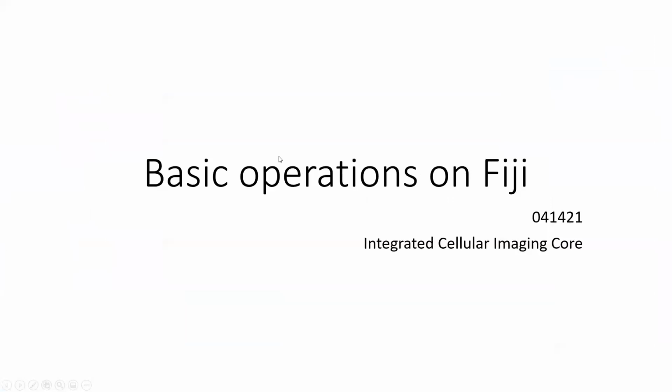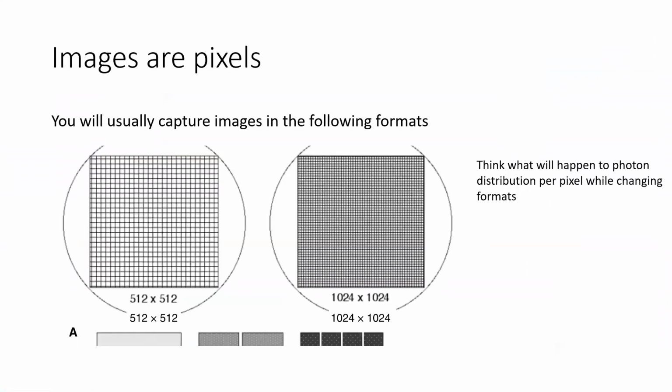So I'll stick to basic operations, and this is very impromptu, informal. If you have any other questions when I go through different plugins on Fiji, do let me know. Okay. So, when it comes to Fiji, first let's talk about a couple of different features of the images.